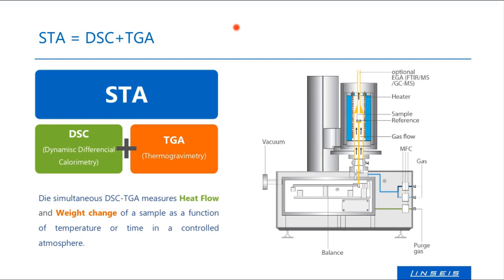Back to our today's topic. As I told you, today we are focused on the STA, so the simultaneous thermal analysis, which is a combination of a DSC and the thermobalance, so DSC and TGA.